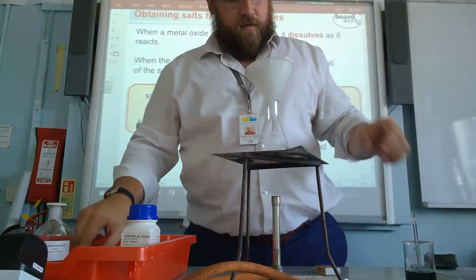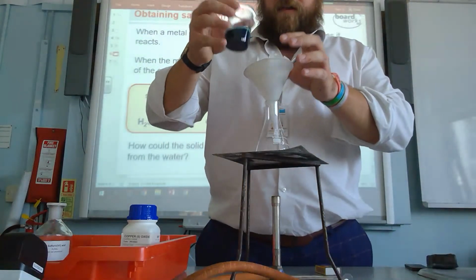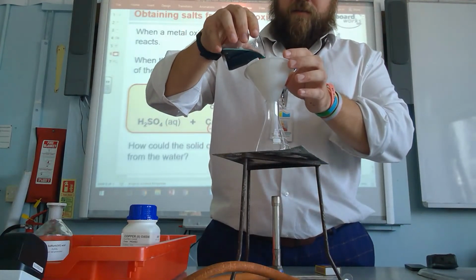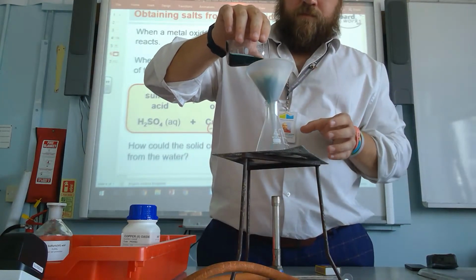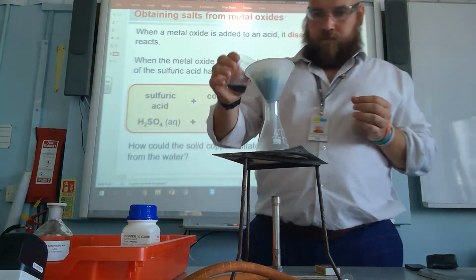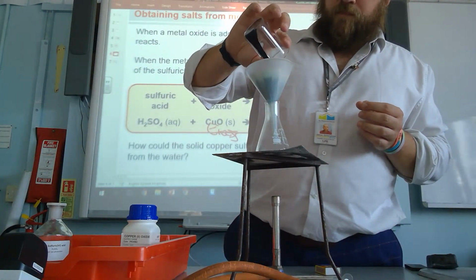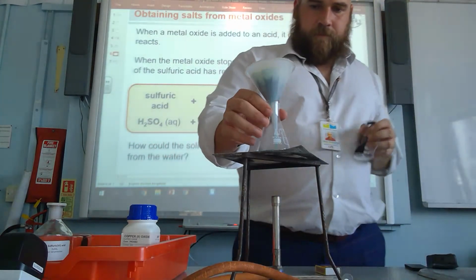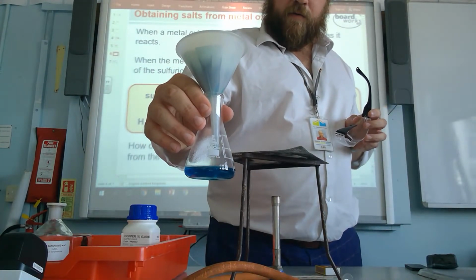And then, carefully, this is cool to touch now, I'm going to pour this through, and then hopefully all the black powder in here, the copper oxide that hasn't reacted, will get caught by the filter paper. Yeah, perfect. So you can see, all I'm getting through is a lovely blue liquid.